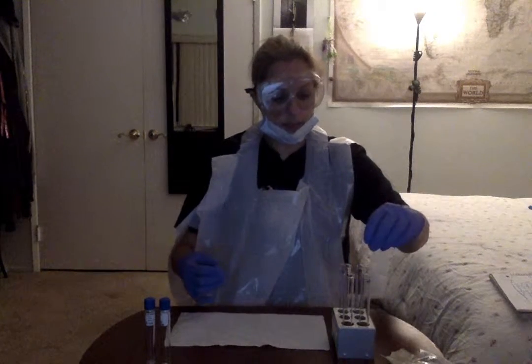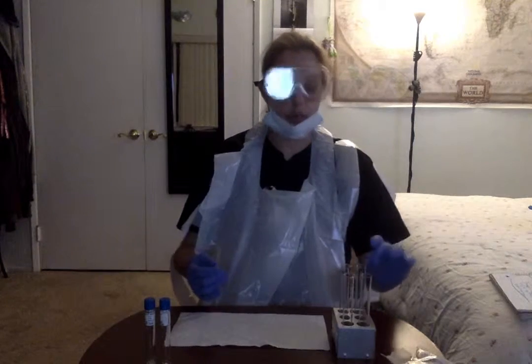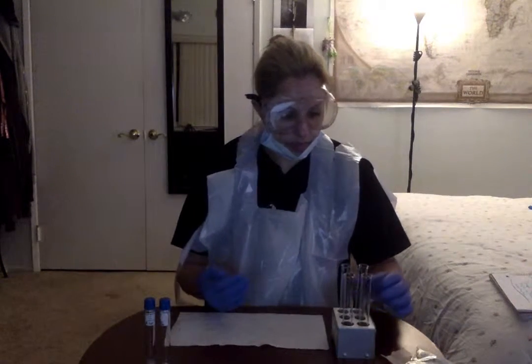We first applied a couple drops, 12 drops I think it was, of Barritt's A into 1 E. coli and 1 S. epidermidis tube, of course the ones that we hadn't used for the methyl red, and mixed those a little bit, and then we applied the Barritt's B. When we applied the Barritt's B, I did let those sit for about 30 minutes.